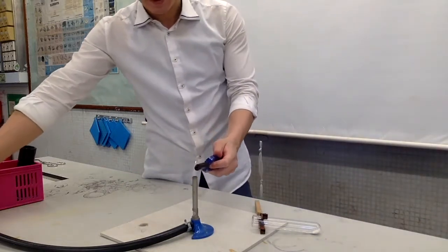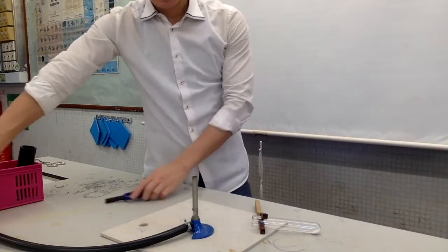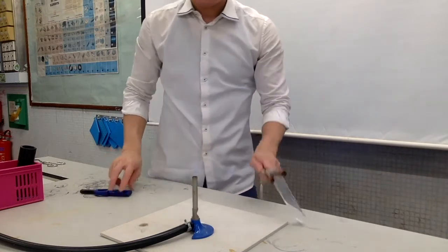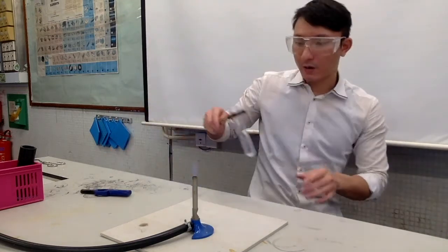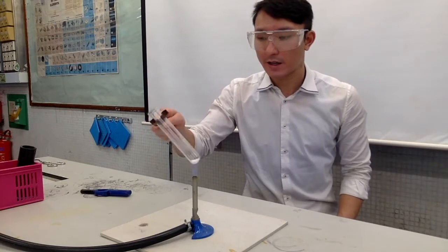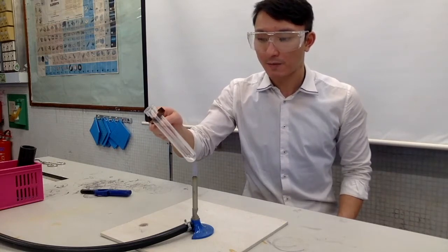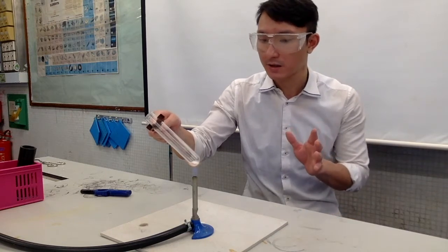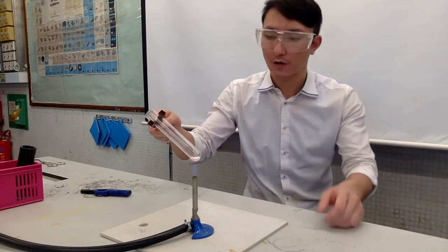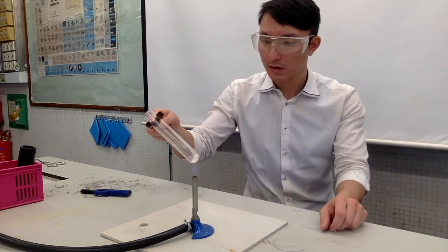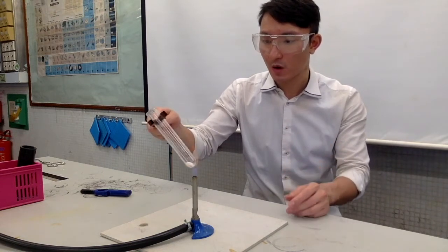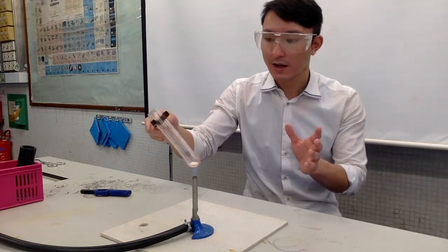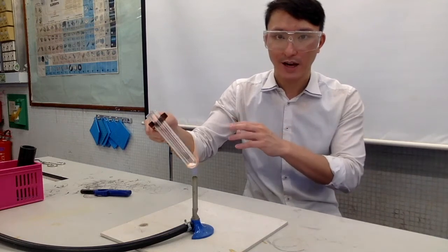We need to light up a Bunsen burner and turn it into a blue flame. We're going to heat the calcium carbonate. According to the manual, we have to heat it for 15 minutes. Pay attention that I am doing a swirling motion, because that makes it heat more evenly and prevents cracking of the boiling tube.